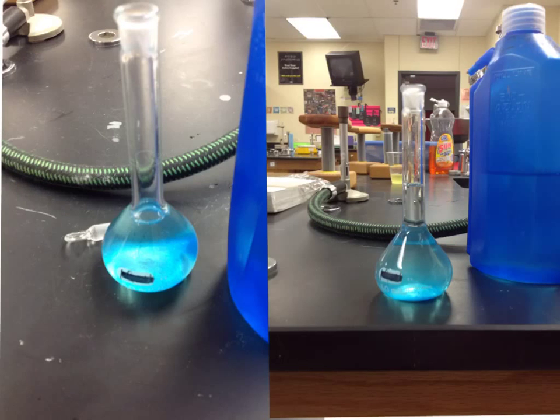So the next step is to go ahead and start adding your water in. You want to use deionized water, so that's the blue containers that should be at all the lab tables. If it needs to be refilled, just let me know. So you'll put a little bit of water into the flask and swirl it around. That's what this picture here is representing. You swirl it around a little bit to get that solute mixed in. And then you're going to continue filling up the flask.